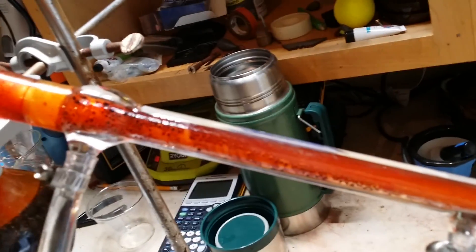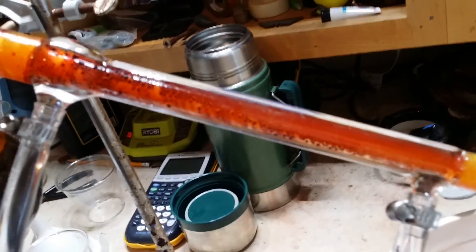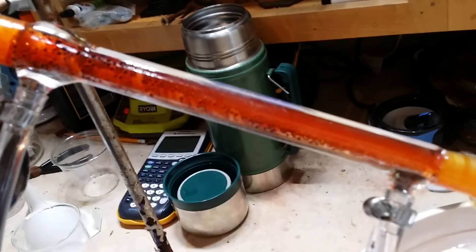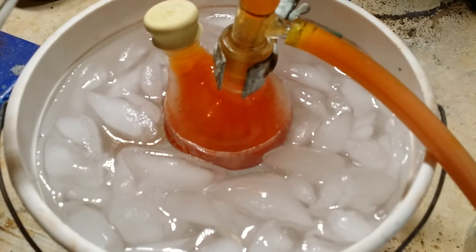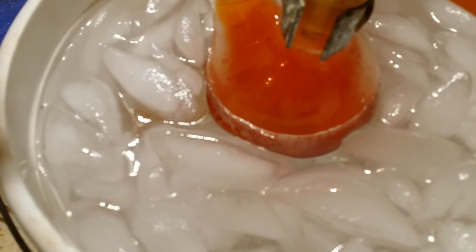I estimate you'll get about 10 to 12 milliliters of bromine each time you do this. You may scale this up and down as you please. There's a bit of liquid bromine in the bottom of the collection flask — there's a lot of vapor in there so it's hard to see, but if I move the ice water a bit, you can definitely see the liquid in there.